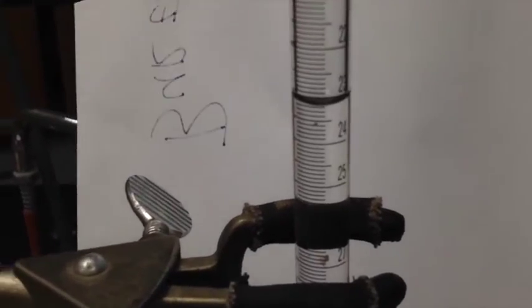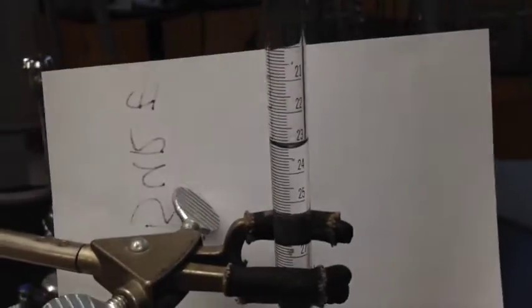And then you'll come back up, and you'll find the meniscus and read the value. You can see the value here ended off. Let's see, there's 22, here's 23. Probably like 23.1, well, here's the bottom line. 5, 4, 3, 2. So I'd argue that's 23.2. Okay, so you can see here is where we ended off.